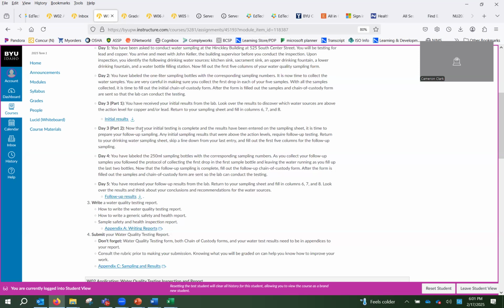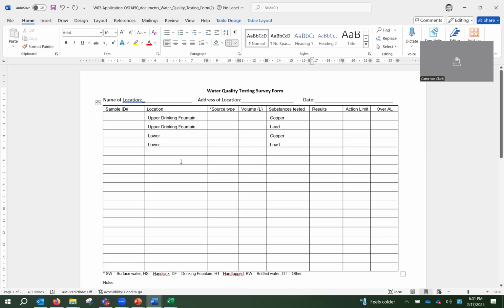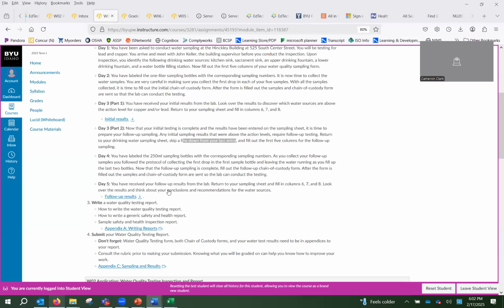What you're going to do is, like I said, follow each and every one of these lines very specifically. So you're going to go back to your water sampling sheet and do our follow-up sampling. So you're going to skip a line or two on your last entry of that sampling form, and down here at the bottom, you're going to have all your initial samples up here at the top, and then you're going to want to skip down a couple lines and then start putting in your follow-up samples down there. And again, using the first five columns.